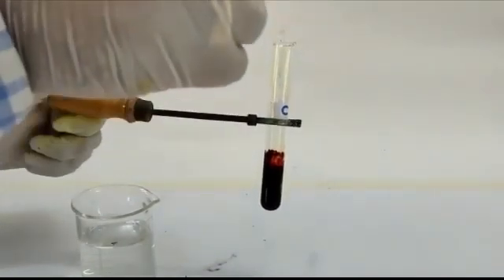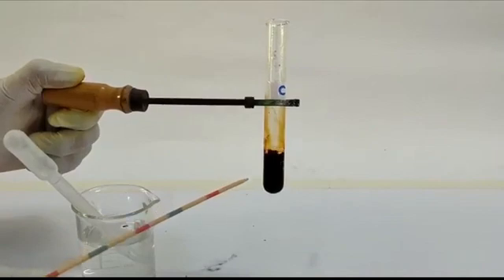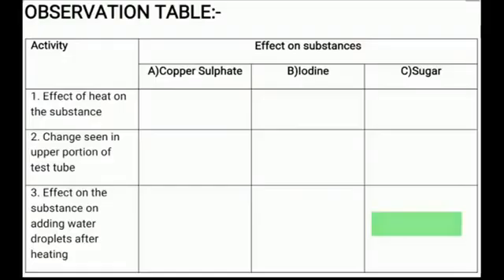Let's add a few drops of water to this test tube and observe the change, and afterwards note it down in the table.